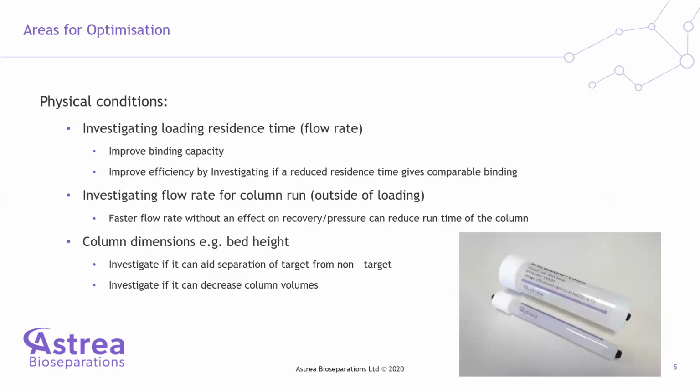The other way that we can optimize the process is to look at the physical conditions. This means we can investigate things like the residence time, which is related to the flow rate at which we're loading. Here we can look to improve our binding capacity by slowing down our flow rate, or increasing our residence time, giving the target more time to bind to the column.